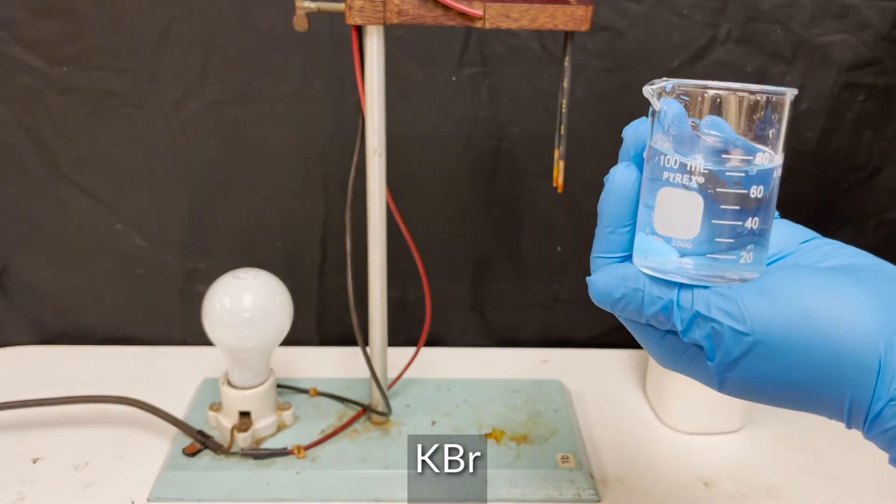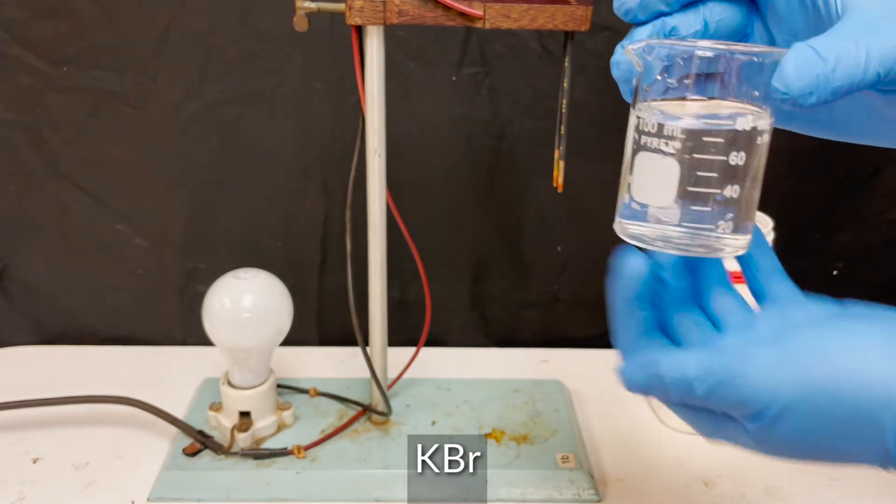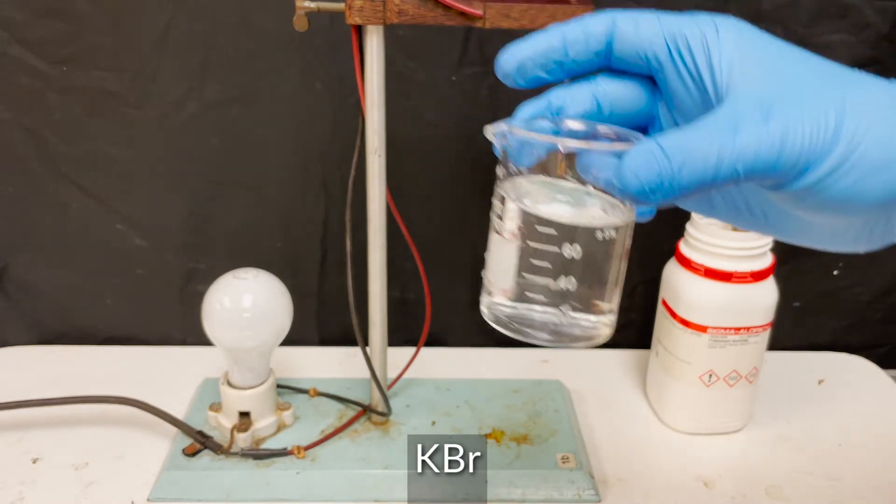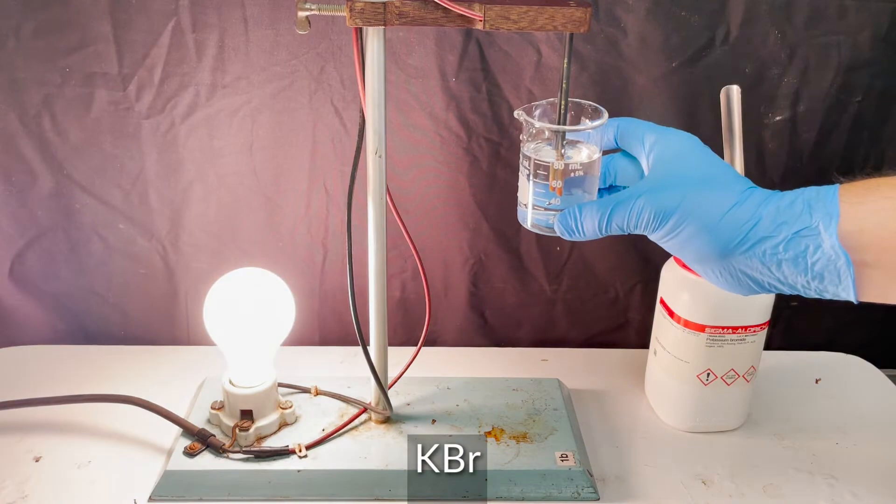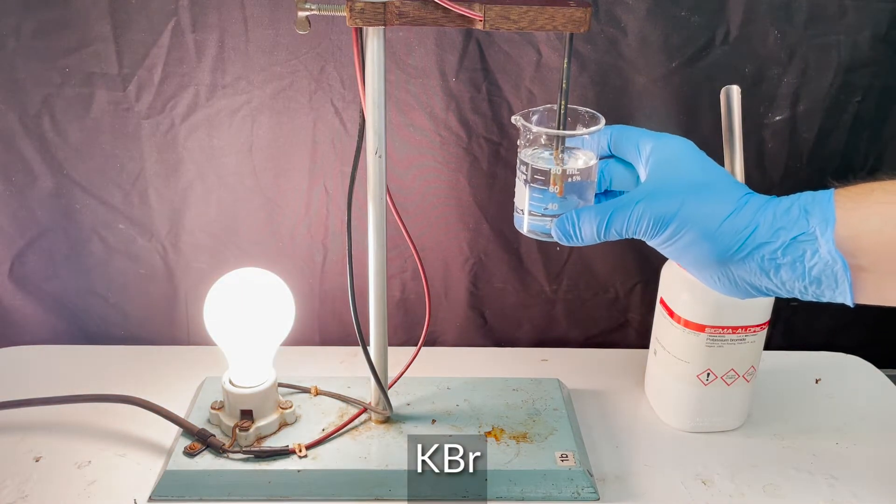As expected from solubility rules, potassium bromide dissolves pretty easily, and we can see that the solution is clear. This ionic compound dissociates and conducts electricity.